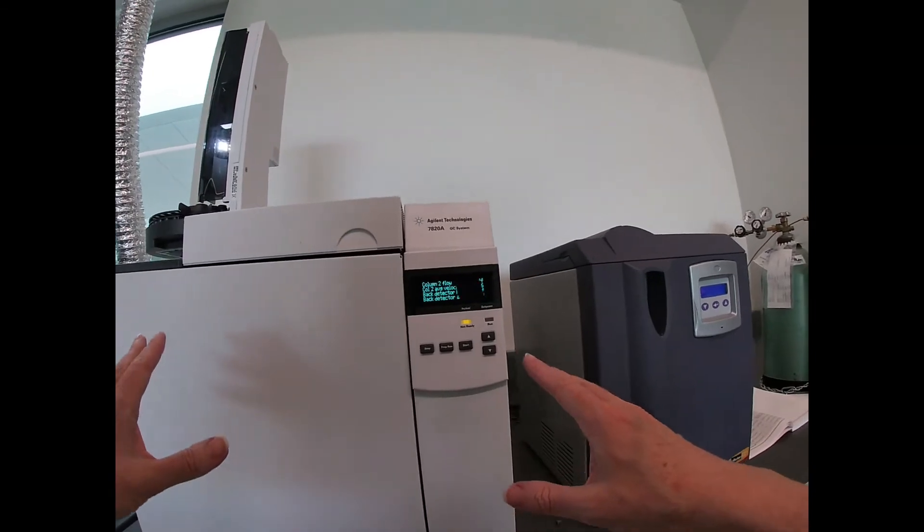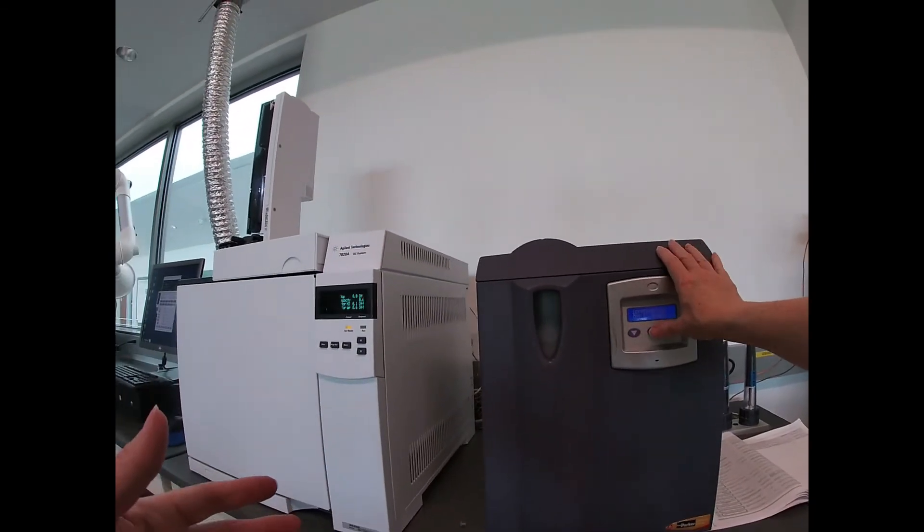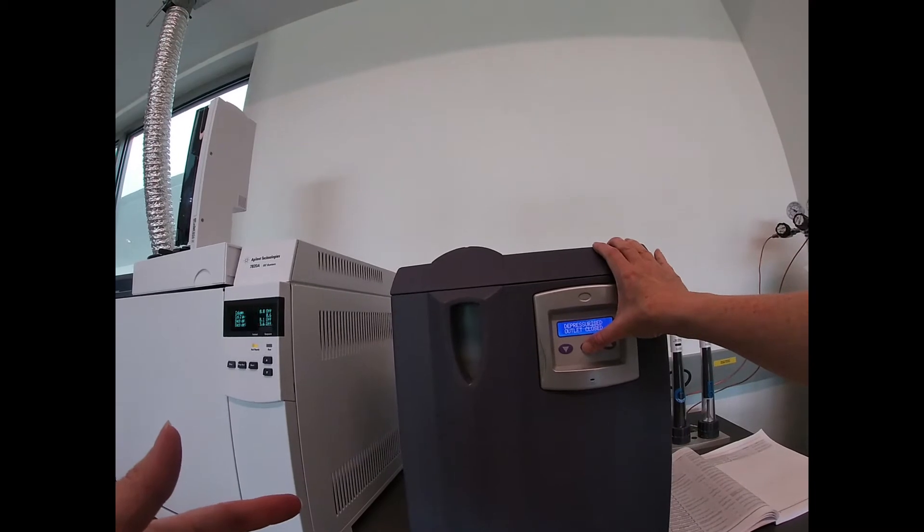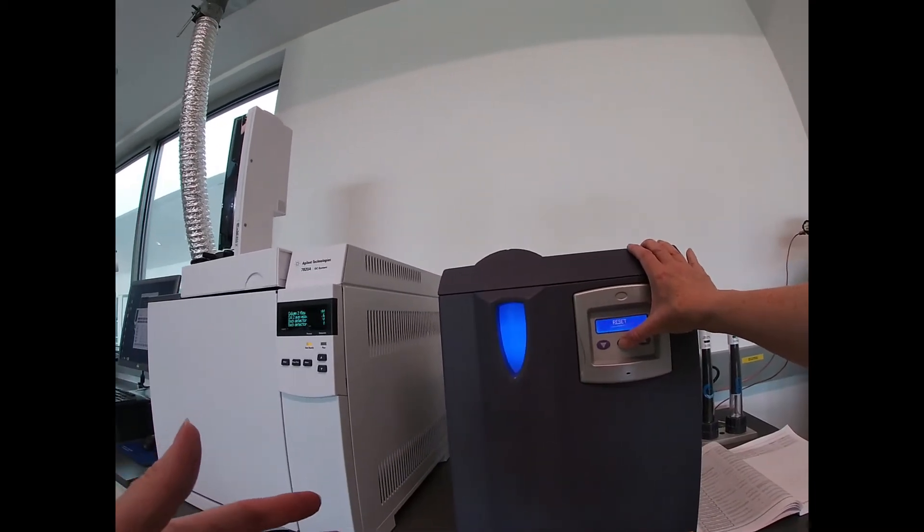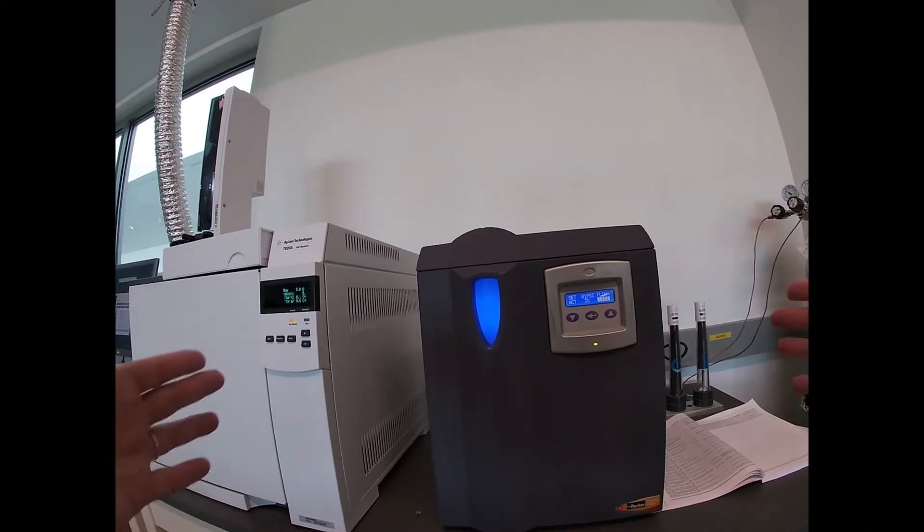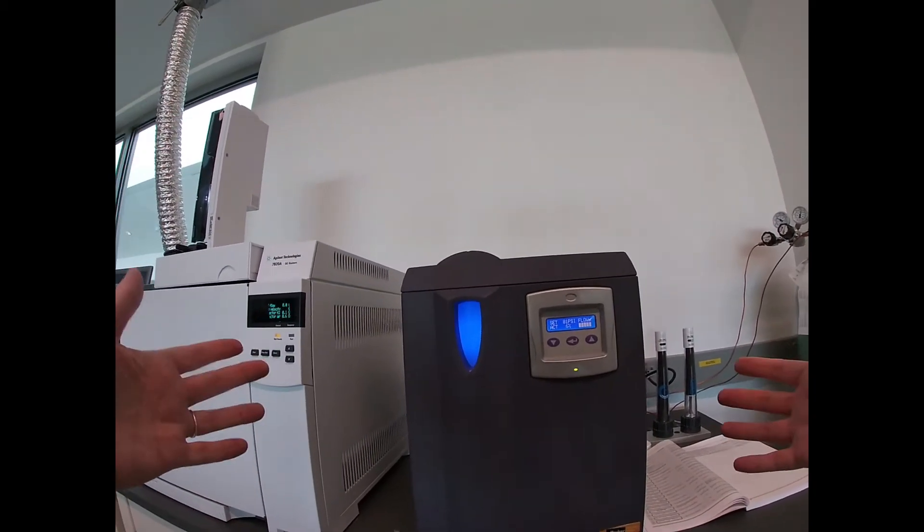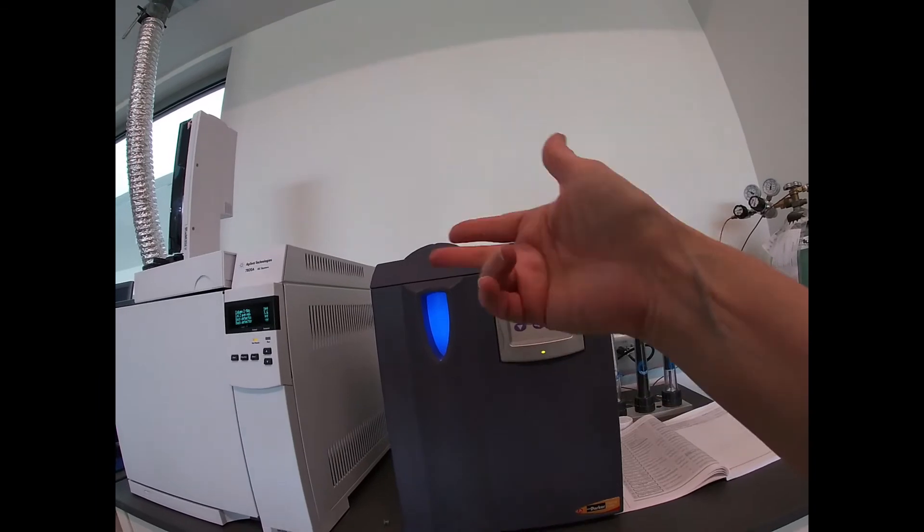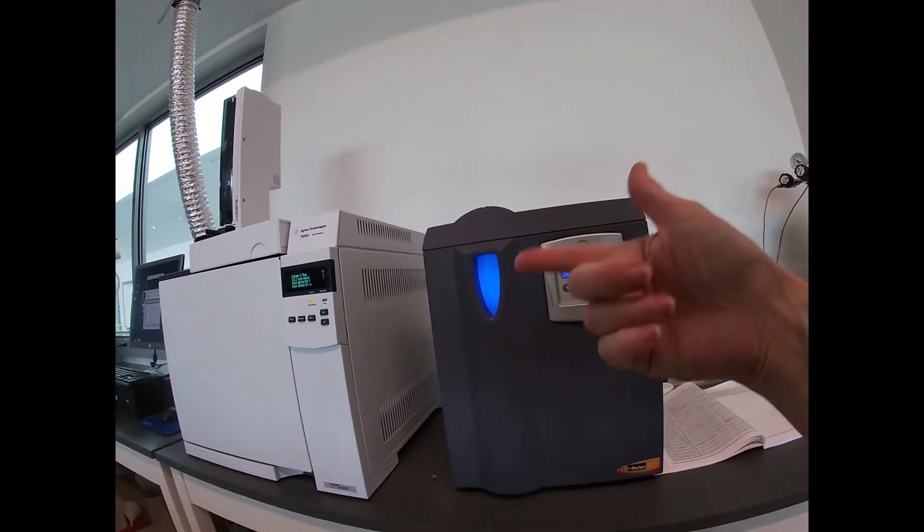This particular instrument, our mobile phase is hydrogen. So we have a hydrogen generator. And so this hydrogen generator actually produces the hydrogen that is used as a mobile phase for our instrument.